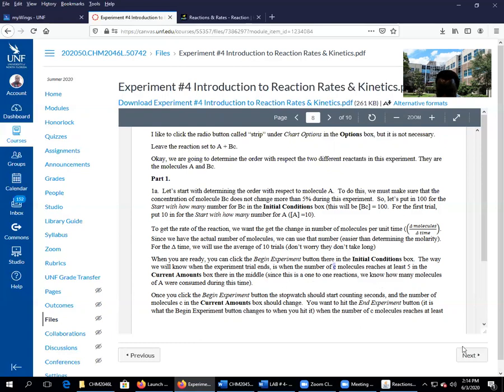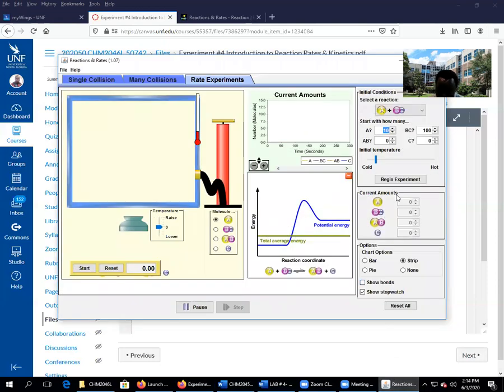You will end the experiment. So this is, let me just start that. What you are giving an eye here is the current amount. You see current amount, this is the C being mentioned. This is the C being mentioned, right?